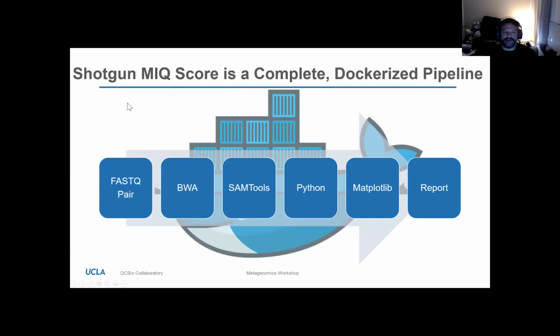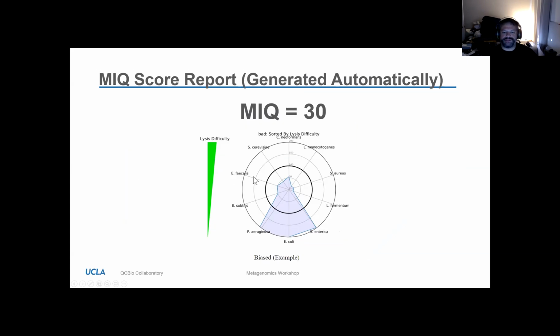As I mentioned before, these are fully automated. And actually, it works for both shotgun sequencing and 16S. What I should say is if you're doing 16S, you get OTUs. So in answer to Tim's question, these are neither OTUs nor ASVs. And the reason I can say that for certain is this is not 16S sequencing, because you see up here that we have Saccharomyces and Cryptococcus. And with 16S and 18S sequencing, it's hard to do the quantitative comparison, so a lot of people don't like to, at least between 16S and 18S.